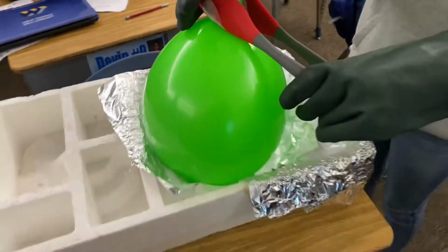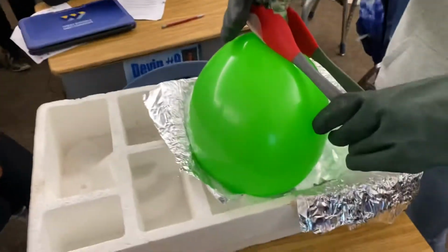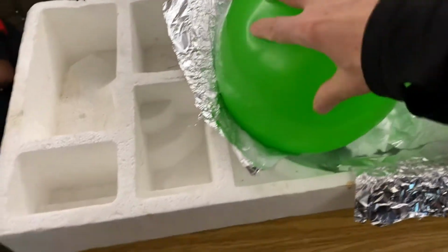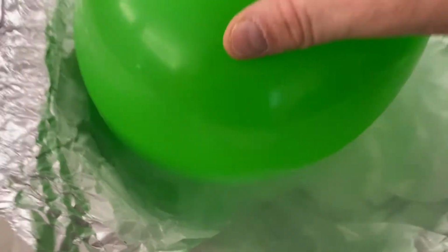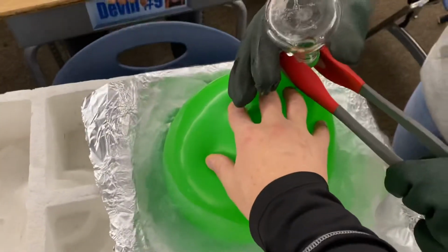That's good. And we want to see what happens to that balloon after it's in the liquid nitrogen for a while. Let's get it right in it. Yeah, that's good. So you can see the liquid nitrogen at the bottom. If I blow on it, you can see it. And right away, you should start seeing the balloon begins to change.